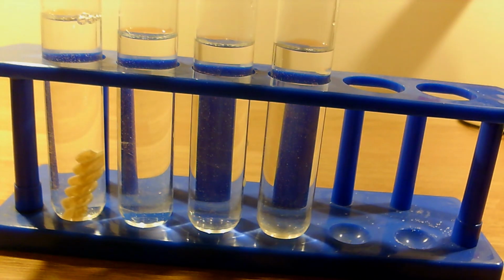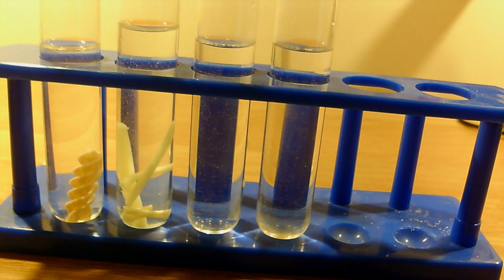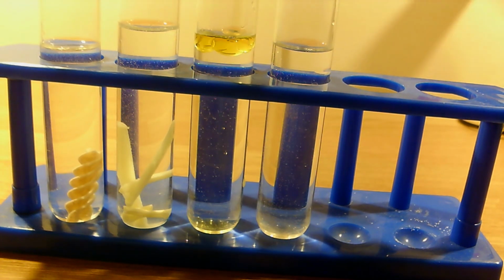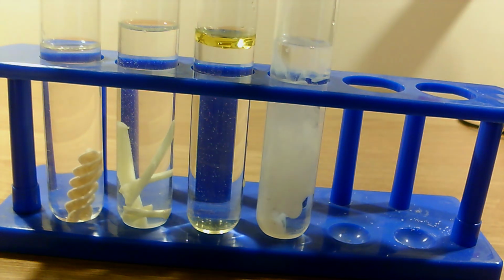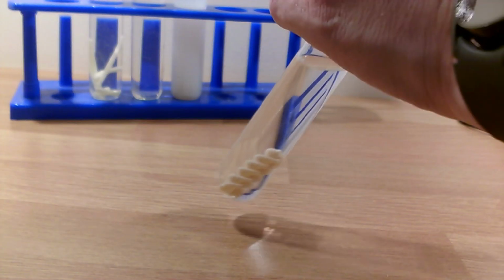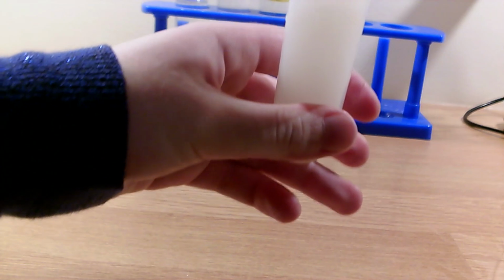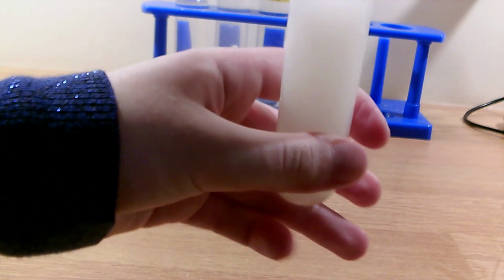The first food test that we're going to do is the food test for starch. The 4 foods that we've got are pasta, cheese, milk and oil. We need to make the food into a solution and then add the test solution, which is the iodine. We are putting all of the 4 foods into 4 different test tubes and then adding water to them. We are going to put the palm of one of our hands over the top of them and gently shake them. We are then adding some drops of iodine using a pipette to each test tube and we will see what colour it goes.